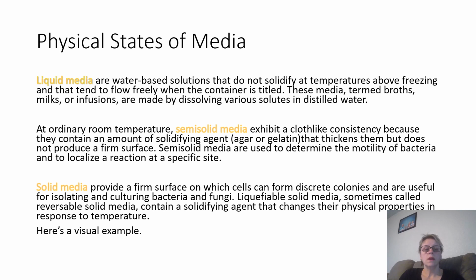Physical states of media include liquid media, semi-solid media, and solid media. Liquid media are water-based solutions that do not solidify at temperatures above freezing and that tend to flow freely when the container is tilted.